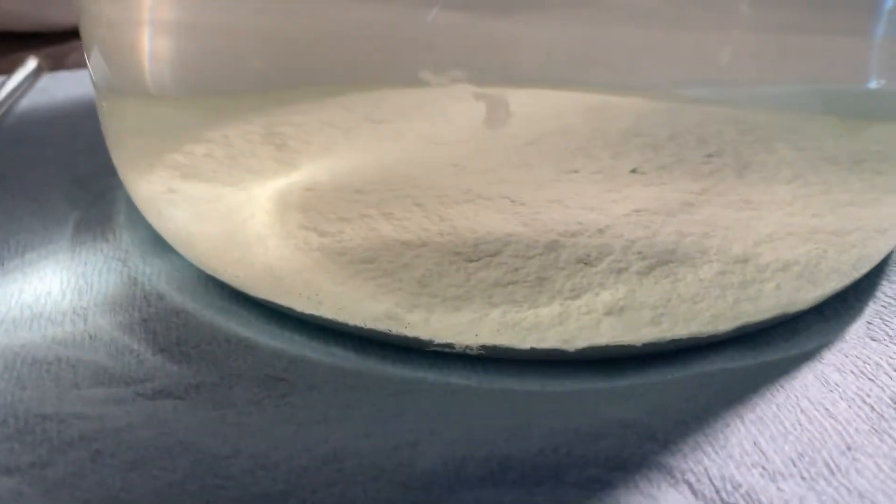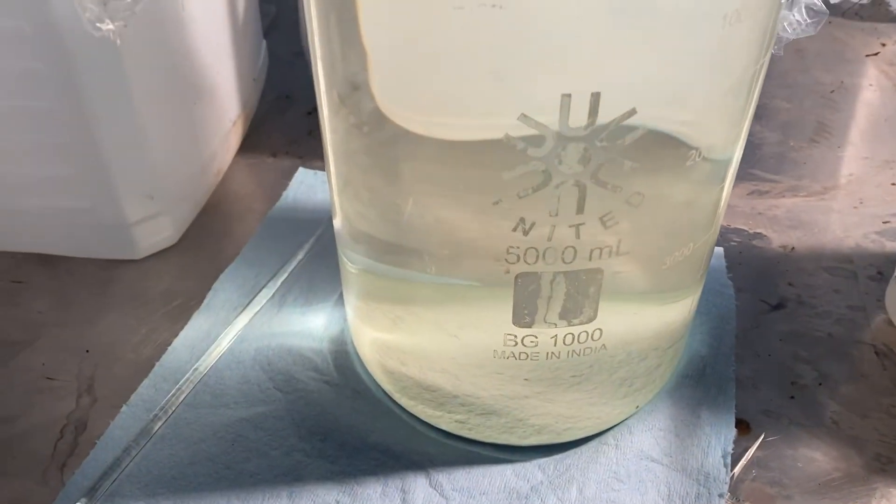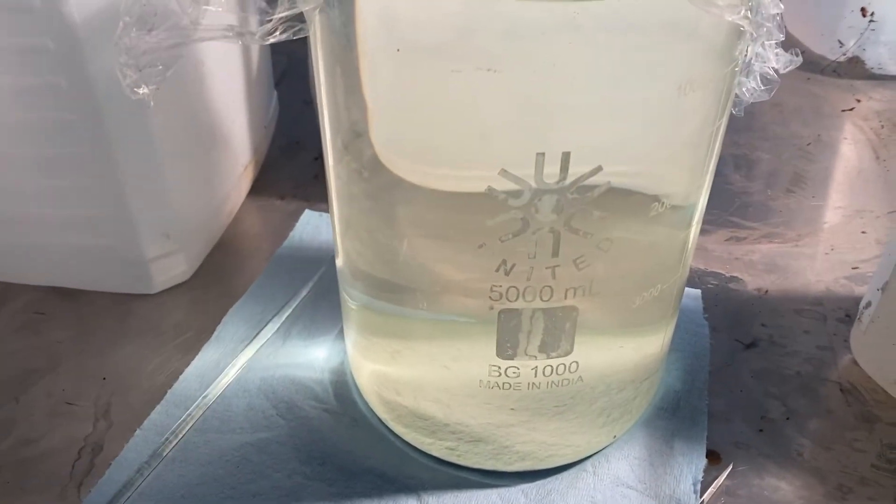After letting it sit out all night and settle, it actually came out pretty clear — just a little bit in there. Now we're going to decant and rinse.